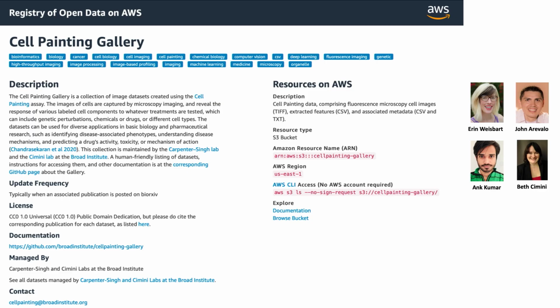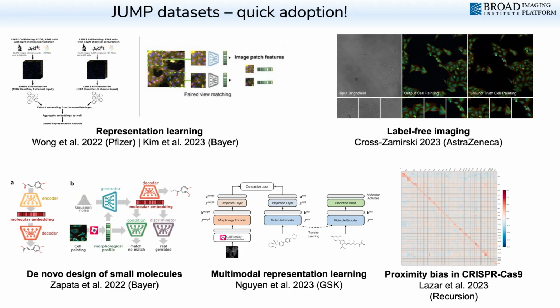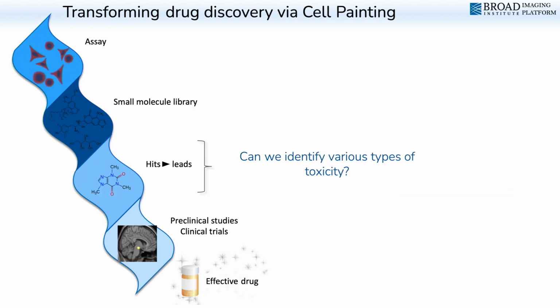and you can actually go and just download it if you like from AWS, thanks to their generous support of it, which would otherwise have cost us something like $40,000 a month to host and to serve. All this data is available now, not just for discovery, but for developing AI models to go and do these discoveries. Massive uptake in the industry and academia, right, a few months after this data set was released.